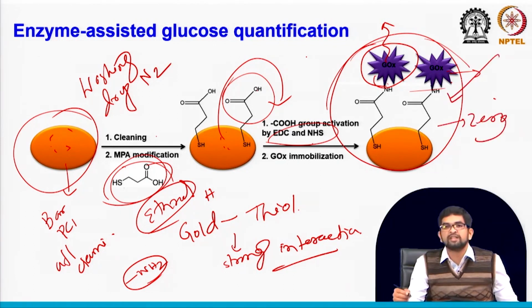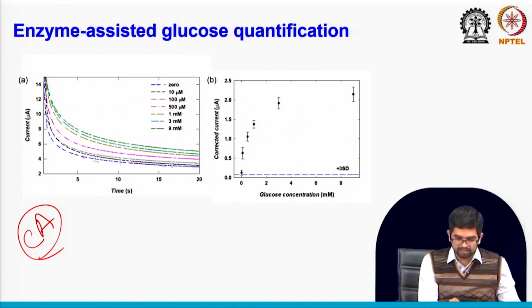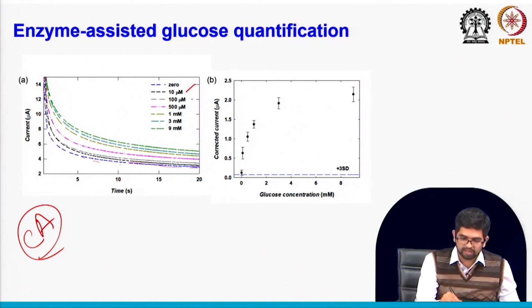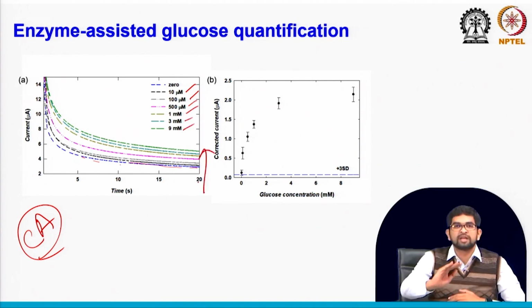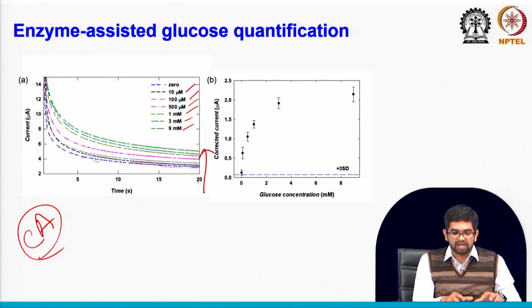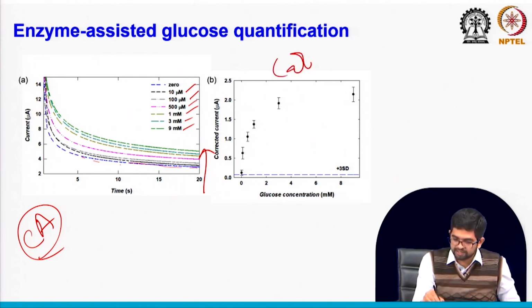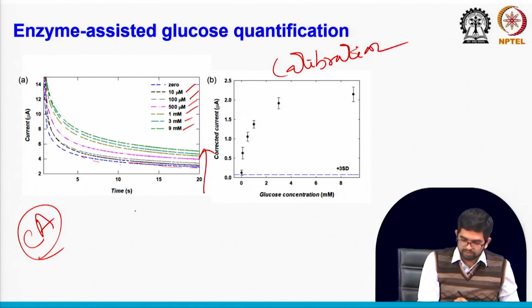You can drop just your solution without glucose here, and then you will see this blue one. This is the zero data. Now slowly increase: 10 micromolar, 100 micromolar, 500 micromolar, 1 millimolar, 3 millimolar, 9 millimolar. We are increasing the concentration, and the current also increases on your sensor surface. The enzyme that is already immobilized on your PCB surface is now showing the oxidation of glucose. Like I already taught you, this is a calibration curve, how to make a calibration curve. Maybe you have to fix a time, suppose 10 seconds.